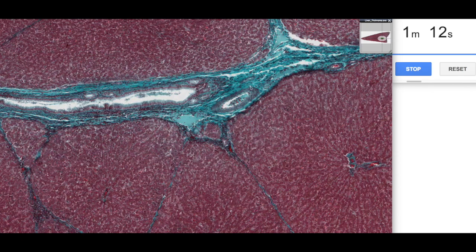The first of these is the branch of the hepatic artery. So here we've got a hepatic arteriole. These are the endothelial cells. These are the smooth muscle that's making up the wall of the arteriole.